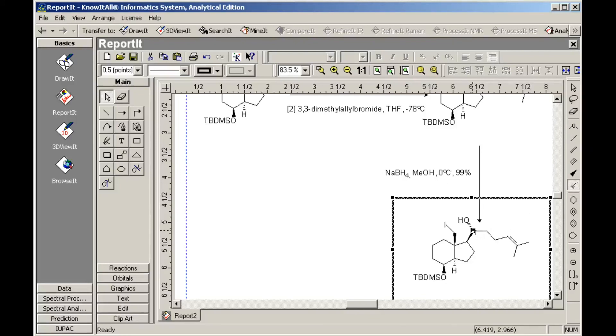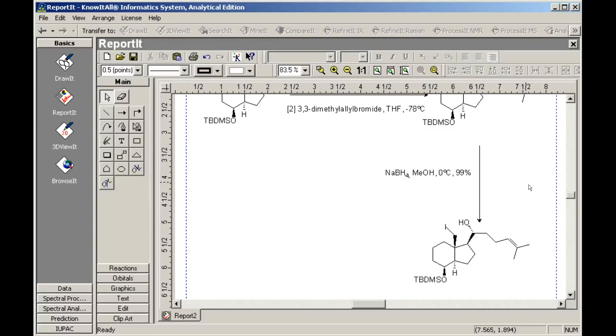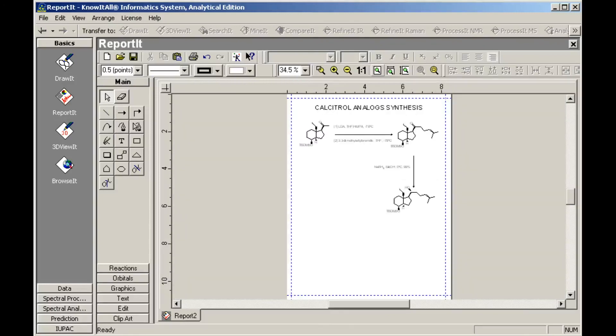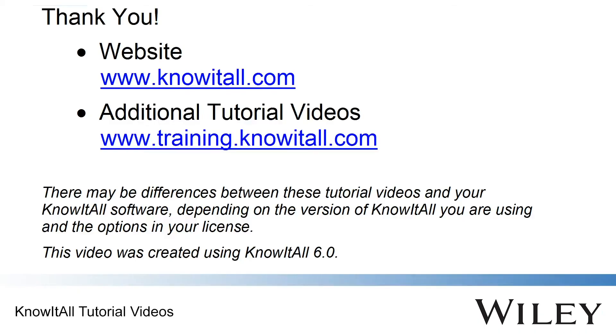Click outside the structure to close the drawing tool bar. Finally, use the zoom tool bar to view the finished report. This concludes our demonstration of how to draw chemical reactions in the know-it-all informatics system.